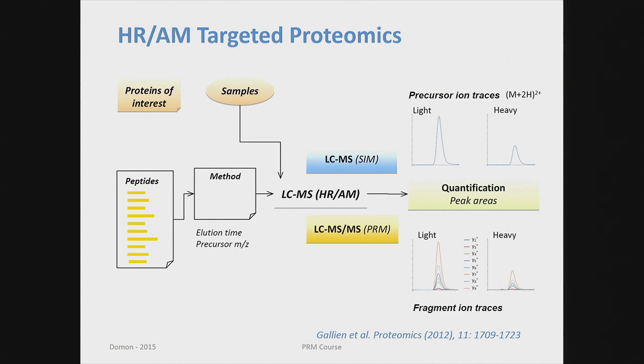As already mentioned, you can basically do two types of experiment. Either you just look at the precursor, and you can use the signal of the precursor, which you also measure every 2 seconds or so, and quantify on the precursor. And this is doable because you have relatively good resolution. Even if you have multiple precursors, they can be resolved, and you can do relatively good quantification, and you can use quite high resolution to separate the different isotopes and the matrix.